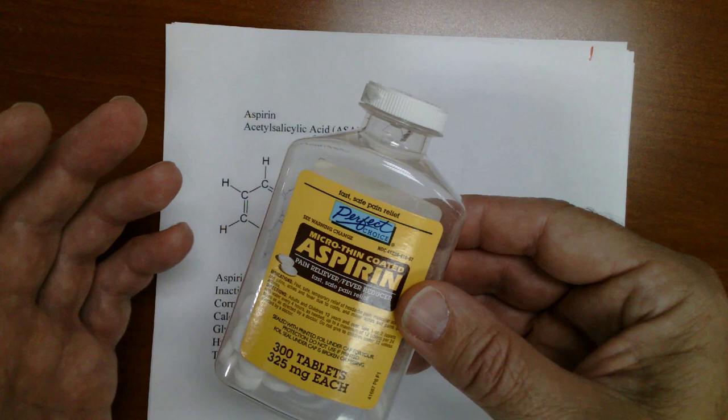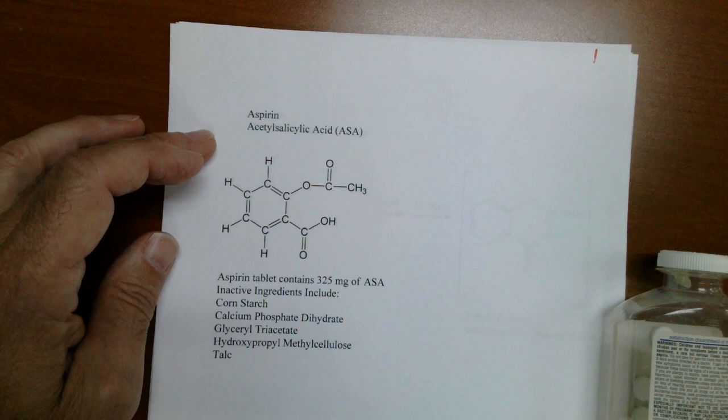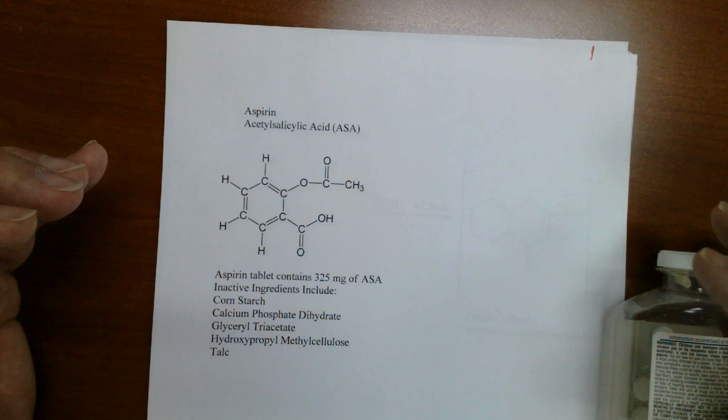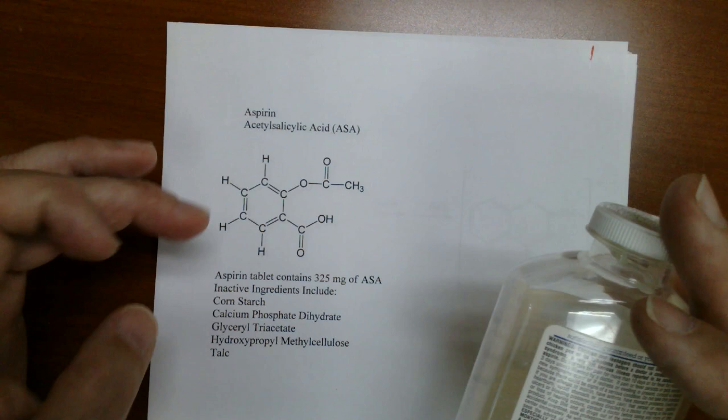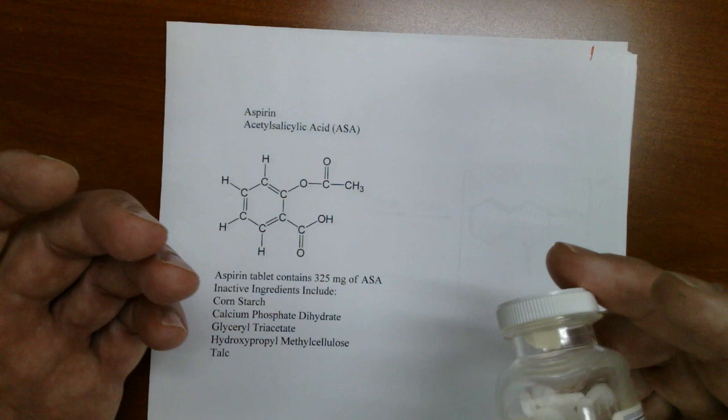Okay, now aspirin itself, the actual active ingredient in this is called acetyl salicylic acid. It's a bit of a mouthful, so I'm going to abbreviate it as ASA. Now each aspirin tablet, in addition to containing the acetyl salicylic acid, actually contains some other inactive ingredients. These other inactive ingredients are for the stability of the product and to render it into a tablet form. You can't just compress everything and make a tablet out of it.